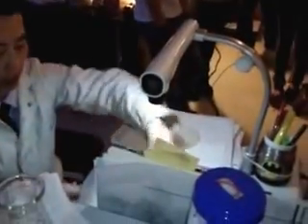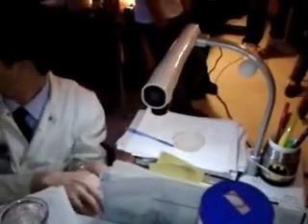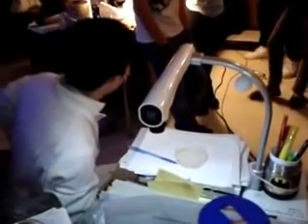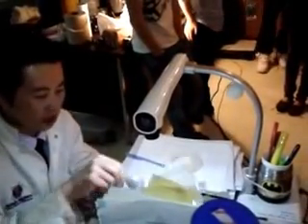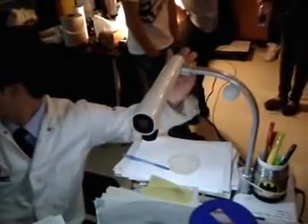Imagine that this plastic bag that has air in it represents the air quality, the air in your community. And I'm just going to put it here. I'll turn it the other way so that you can see the top of the Ziploc bag. So imagine that this air represents your community that you breathe in.